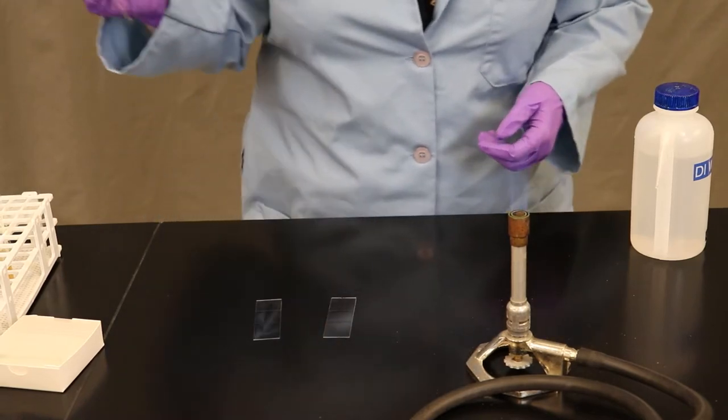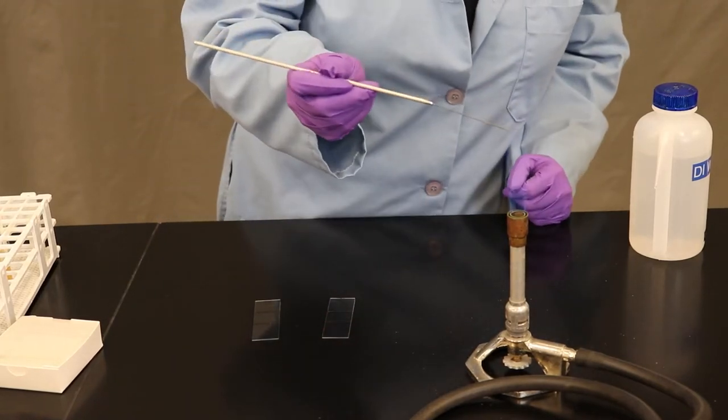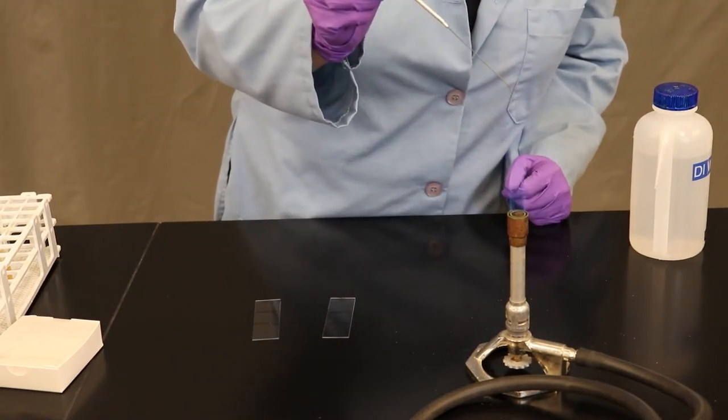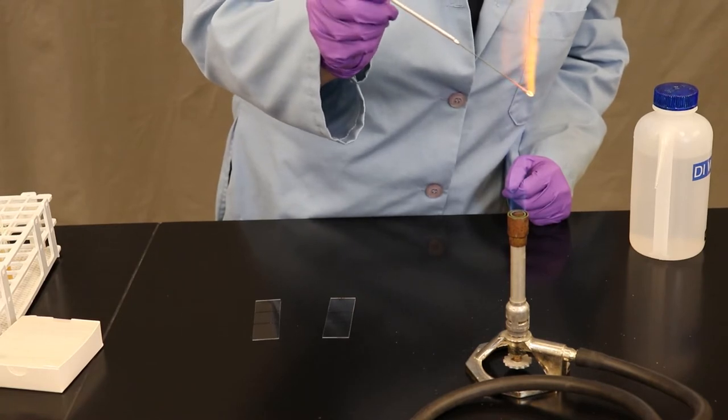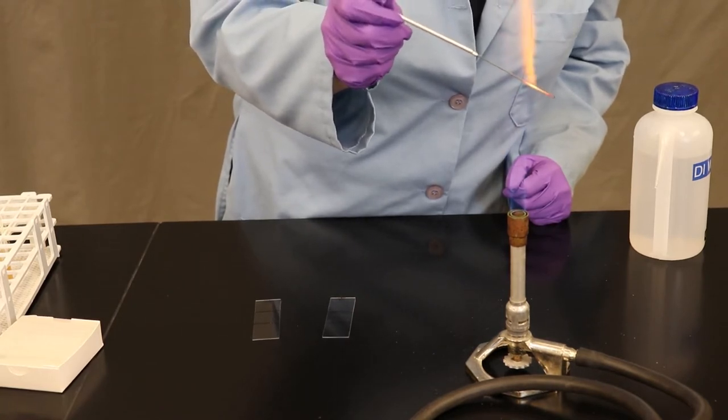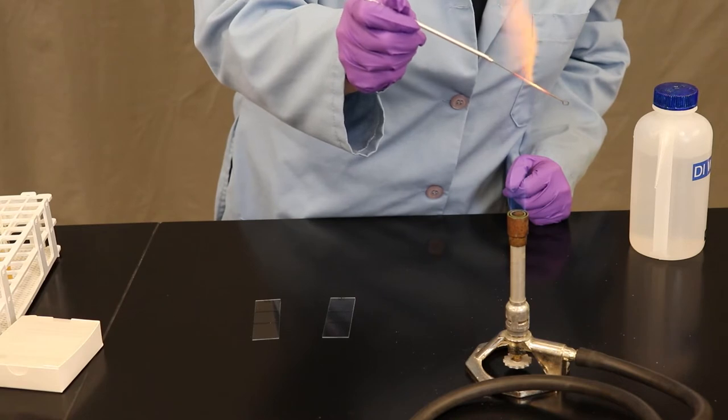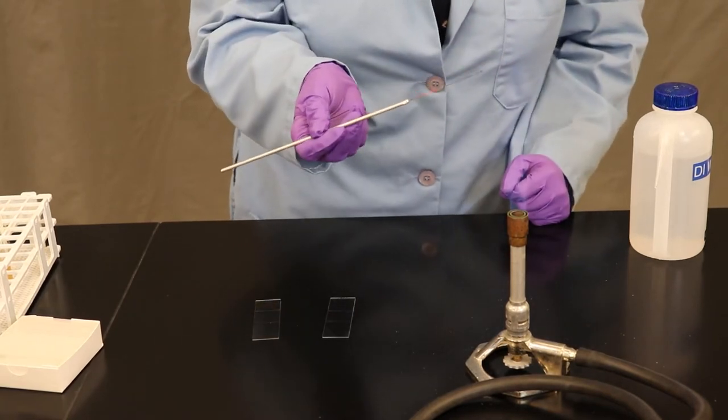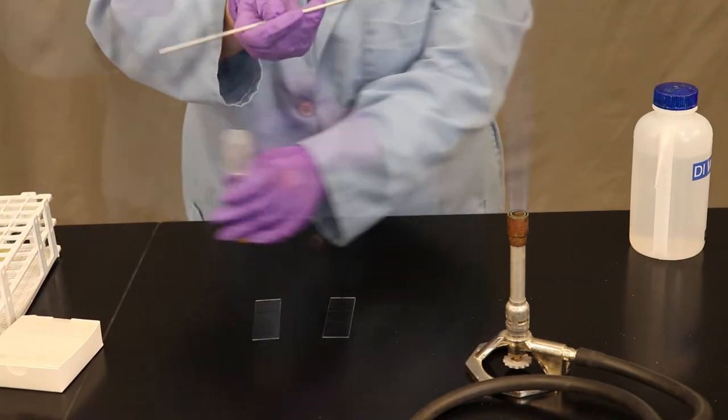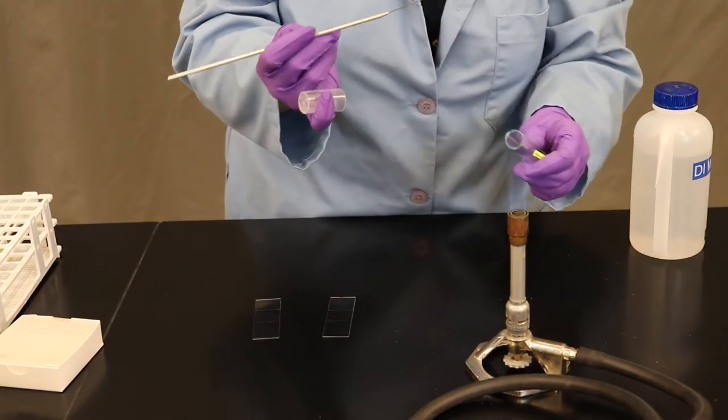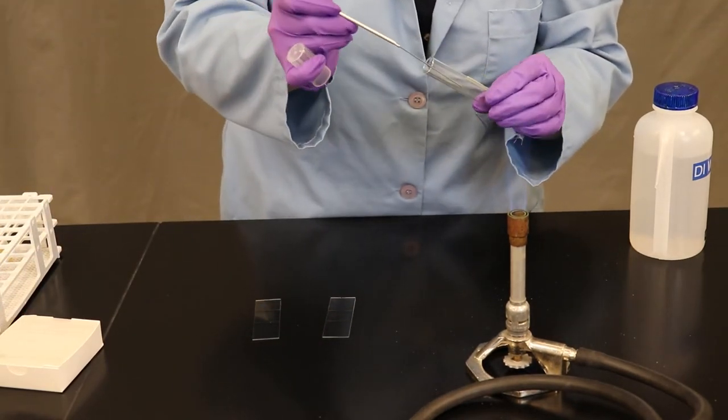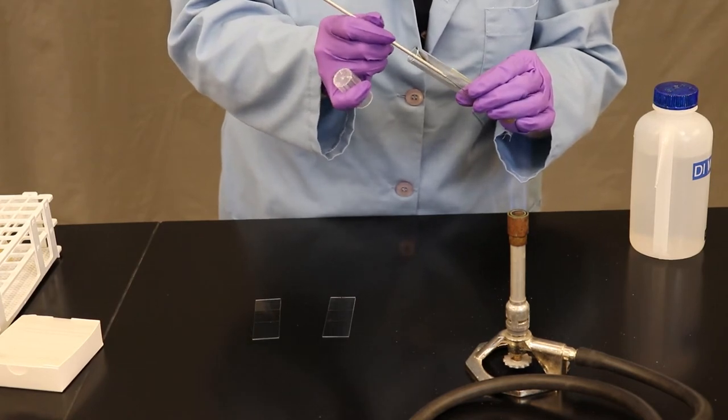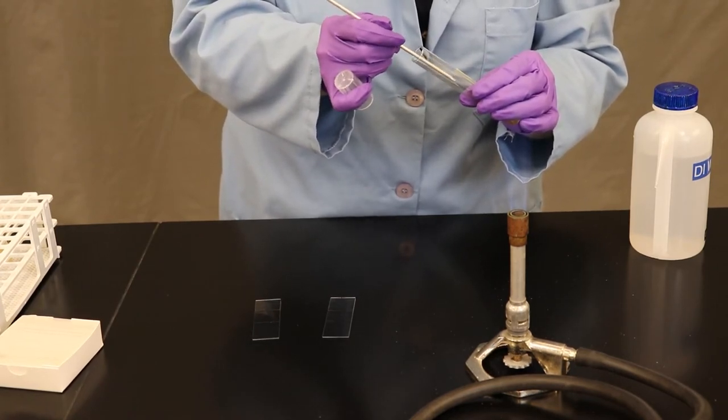Take your metal inoculating loop and sterilize it by holding it through the inner cone until the length of the wire turns completely orange. Allow it to cool for a few seconds. Make sure not to wave it in air, blow on it, or touch it to your skin to cool it. Once cool, you will remove the cap of the test tube with the little finger on your dominant hand and pass the test tube through the fire.